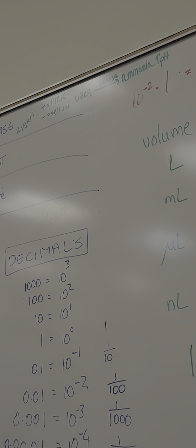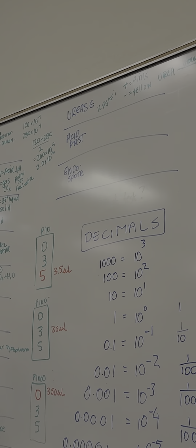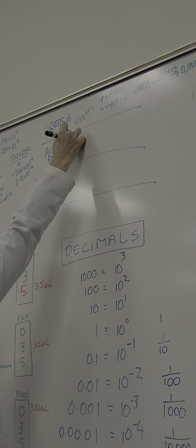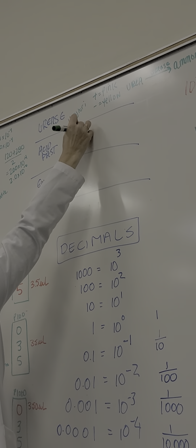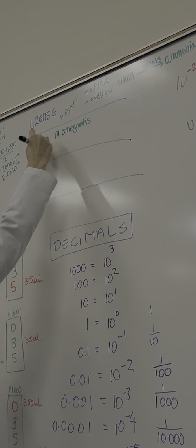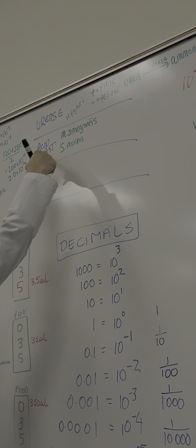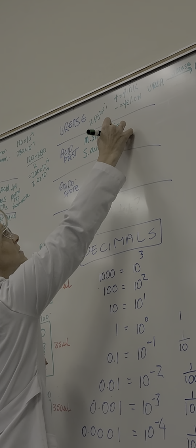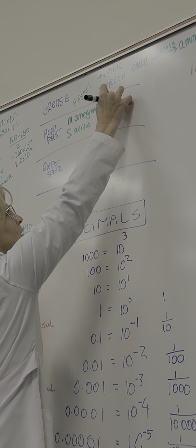Is urease positive? Okay, acid fast. Here we go. We can do this one. Everybody, what are the two organisms that we did for acid fast? It's okay if you can't remember. Smegmatis. And then what was our second organism that we used? And what is the whole point of the acid fasting? To find if it has that mycolic wax on the surface. I'm sorry, can you explain the mycolic wax? Yes.